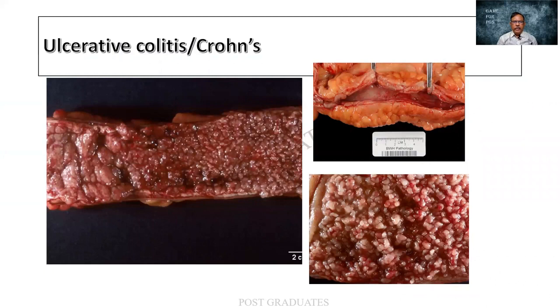We are towards the end of the previous class, which dealt with the ulcerative lesions and the polyps. In the ulcers, we had seen Crohn's disease, wherein there is a thickening of the wall and a narrowing of the lumen, producing what is called a lead pipe or hose pipe-like rigidity, creeping fat, etc. Ulcerative colitis, on the contrary, is limited to the colon, with terminal ileum involvement in some cases, which is called backwash ileitis. Otherwise, it is a continuous lesion.